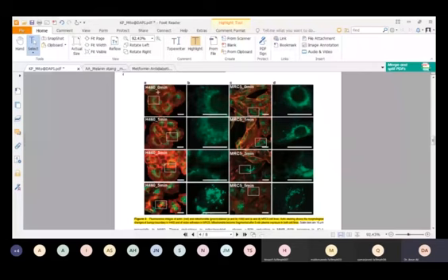So here you can see this is the no plasma treatment. They represented it as 0 minute. This is the control sample. This sample is not treated with anything like plasma or any stimulus. However, this sample you can see is treated with 1 minute plasma, and this one 3 minutes, this one 5 minutes. The case is the same for this cell line as well. So these A and C images are actually the stain data, and B and D are actually the magnified portion of this data. Like this B image is the magnified section from here. The case is the same for here, here, and other pictures as well.